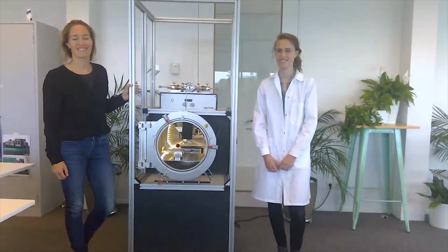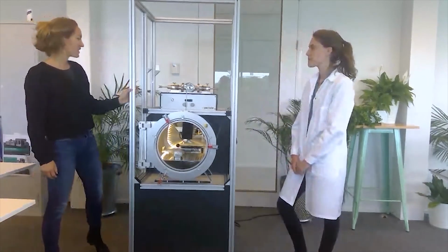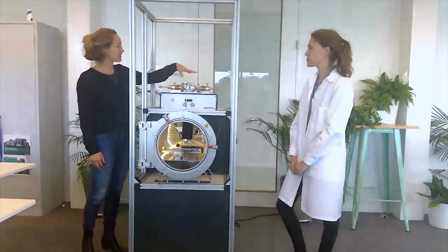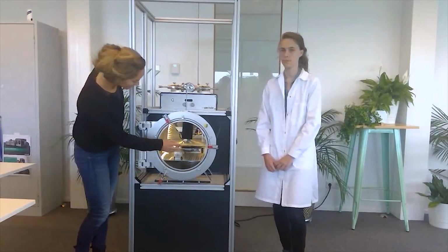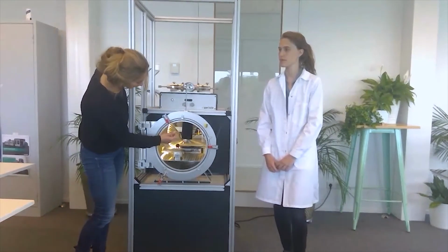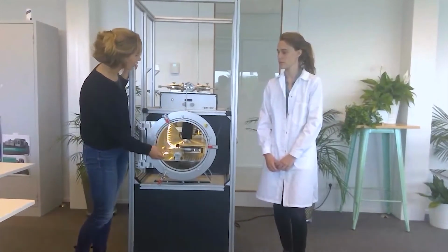Our first question is, how do you clean the system? I can give an answer to that. What we do when we change the electrodes, we take this part out, the reactor chamber, and then we clean the inside of the reactor chamber. What we also clean is the nozzle, so you can screw it off, and then change the nozzle and also clean it in an ultrasonic bath.